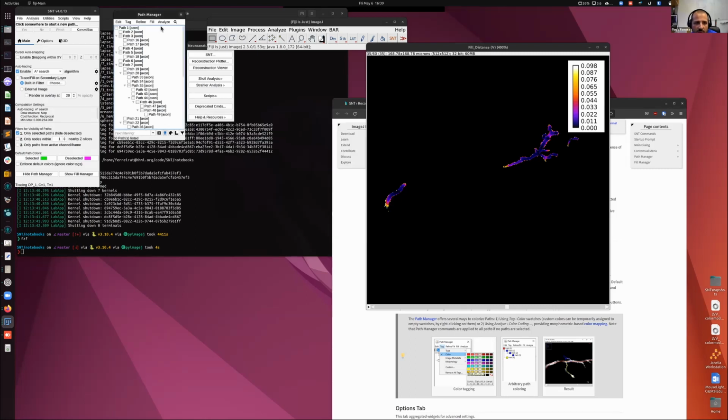Okay, so that's one thing. You can measure all sorts of things about these. Because I've traced one path, it's telling me I found two cells, cell number 2 and cell number 1. Which one do you want to measure?